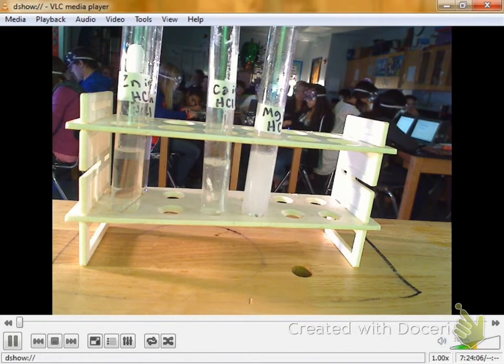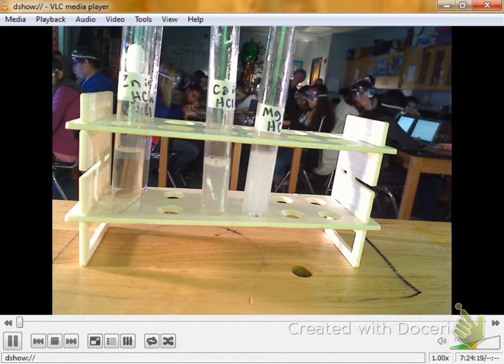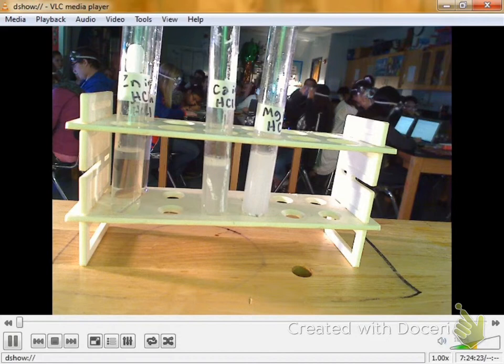And this one right here, somebody remind me at the end of our little demo to come back and show you the hydrogen chloride and calcium one. There'll be a nice precipitate. Ooh, there's a new word for you guys: precipitate. What does precipitate sound like? It sounds like precipitation. What is precipitation? Rain. So it's something falling out of the sky, right?